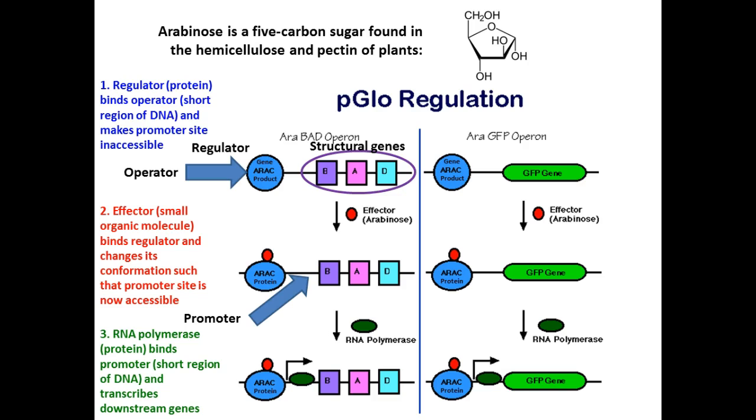So only one of our plates will glow tomorrow. I've got some that we made last week. You guys can take a peek at some glowing ahead of time. But it's only the one that contains arabinose. Only one of the plates contains arabinose, so only one of them is going to glow.